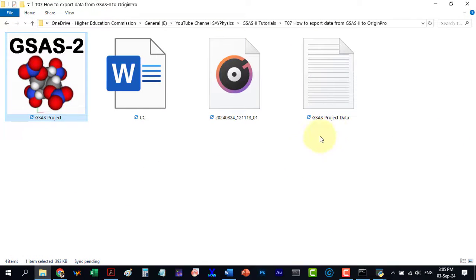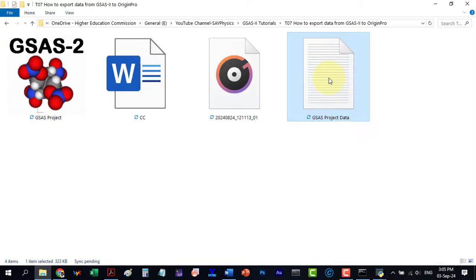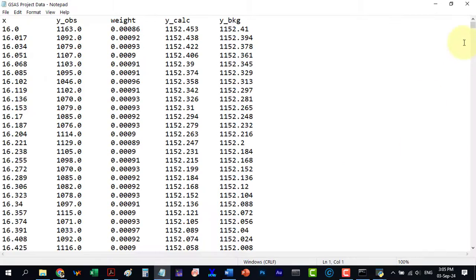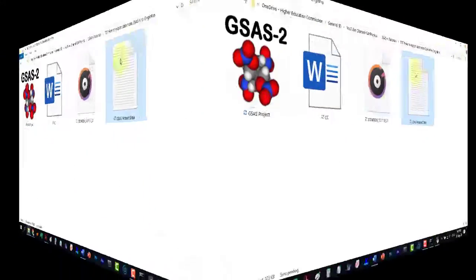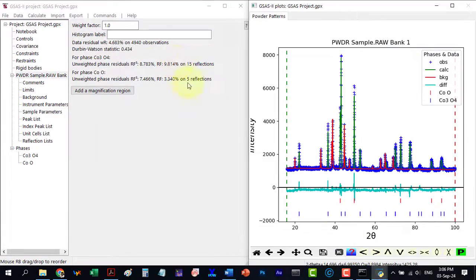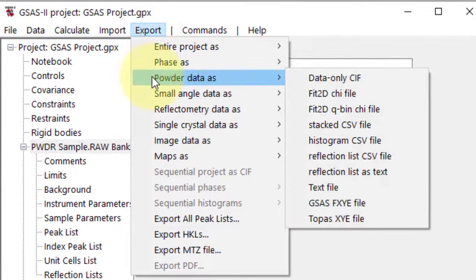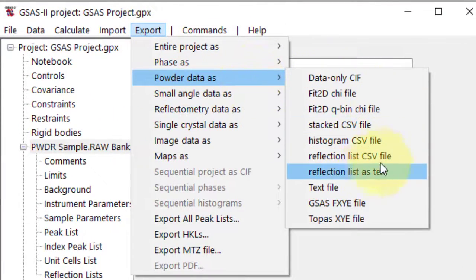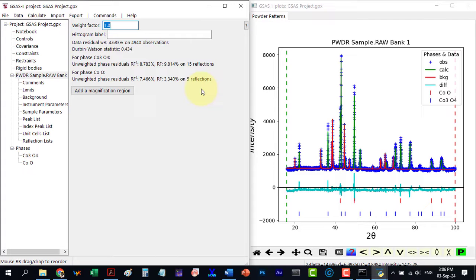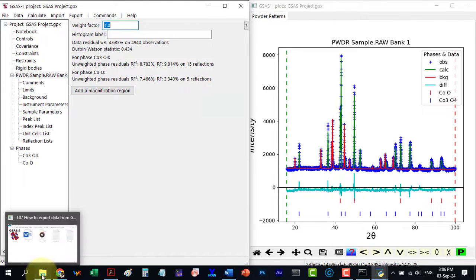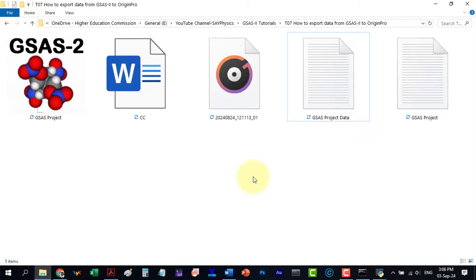Here is our exported folder data in text format. Now return to folder data and this time select reflection list as text. The file will automatically save with the project's name.